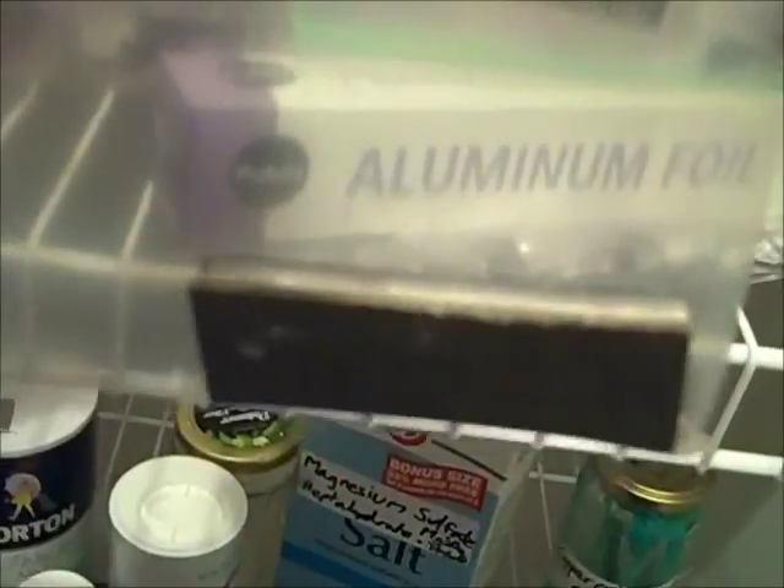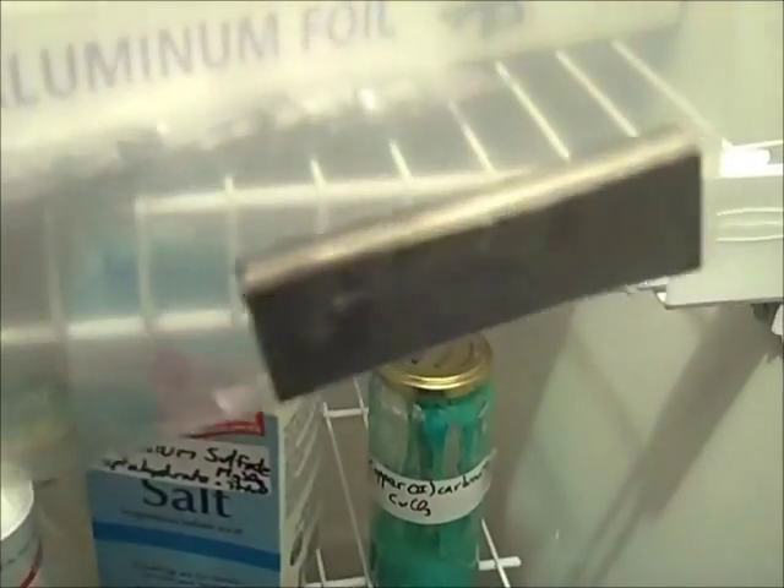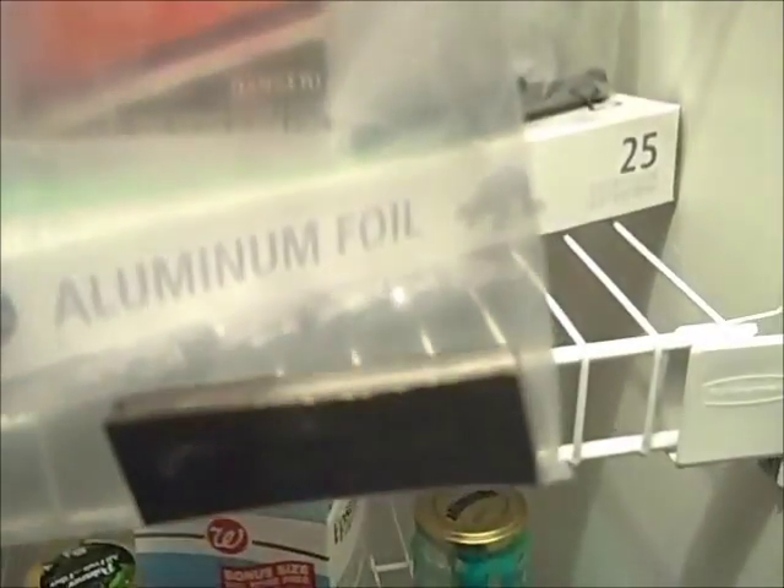My next bag contains — crap — magnesium metal. It is from a camping stick, after which I have removed the flint from it. It would cost you around $2.95 to get this at Walmart. It's about 30 grams of magnesium.